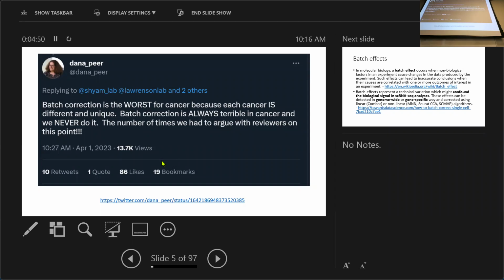So in data analysis, you can separate the African cell line from the European cells very clearly, and you can group them, so there is their difference and no batch effect difference. You mix them and sequence separately, and they're still distinguishable based on their genetic background and their expression profile.